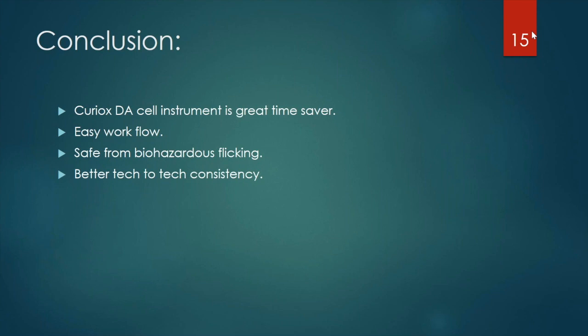Okay, next question. Is there ever a problem mechanically where the probes of the instrument don't align with the nodes at the edges of the well? And if so, how often? That had been my biggest fear initially, because there are so many nozzles there, 96 into 2. So I was always concerned that there could be a clog, and I wouldn't know that maybe in the middle of the wash this clog would happen, and I wouldn't know.